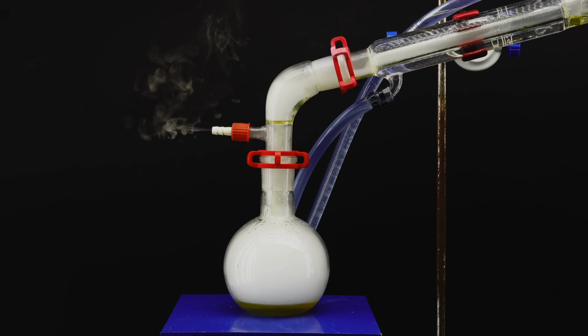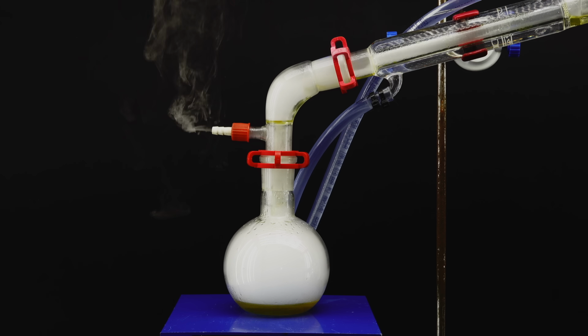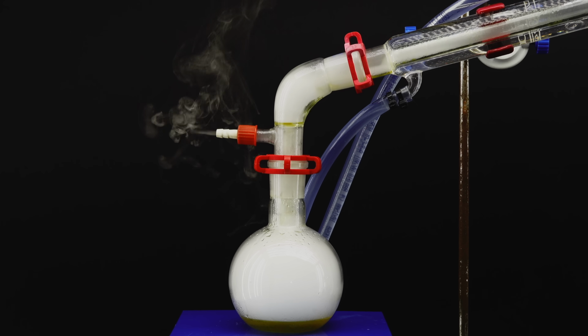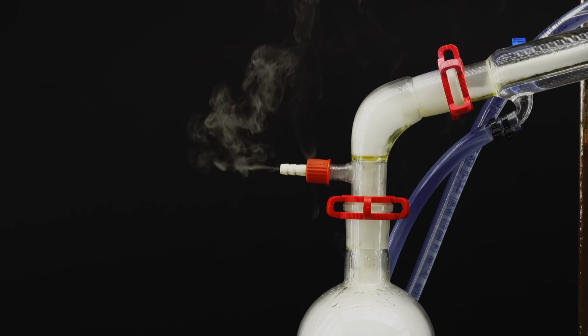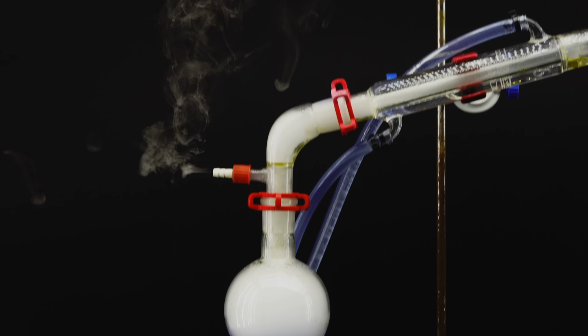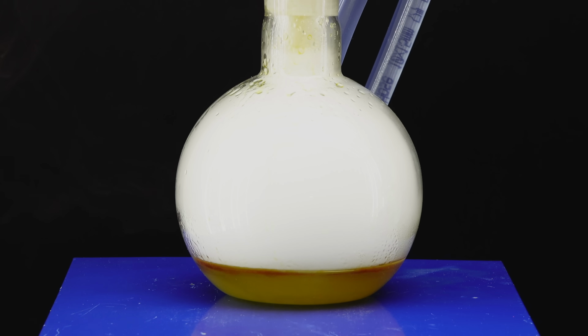At first, mostly just the glycol came over as this yellow liquid. There was also a bunch of some awfully smelling cancer gas, which made this whole thing even more dangerous than it already was. I luckily did all this in a very good fume hood, and after a few minutes of intense heating, some brown oil started making its way into the receiving flask.